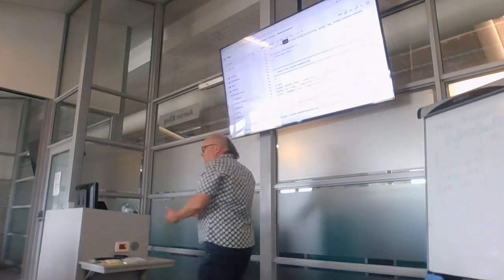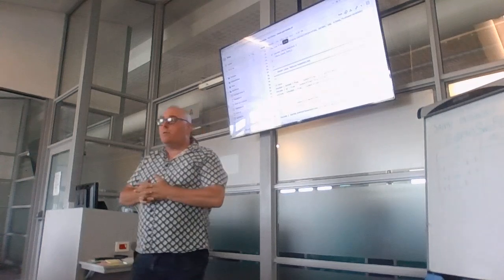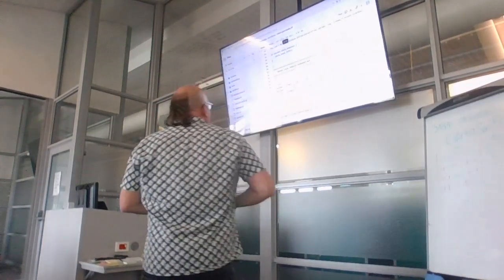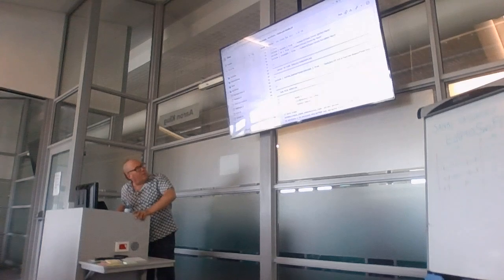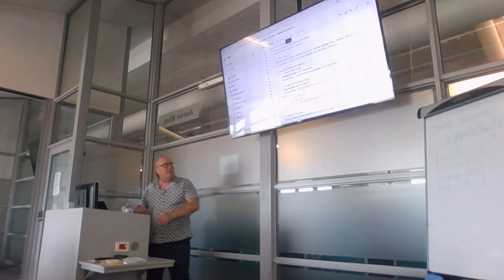Okay, so if you read the Bactopia documentation, then one of the things that you'll see is that you can actually tell Bactopia to download data from the internet. Okay, so what Gather does is it prepares your data ready for analysis. Okay, QC, quality control, and then Scrubber. So let's see what it does with these things. Okay. And here's the main workflow, clean your reads.